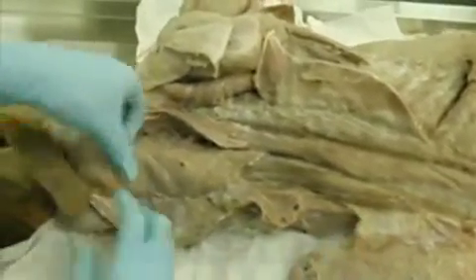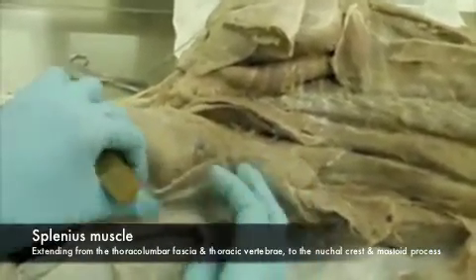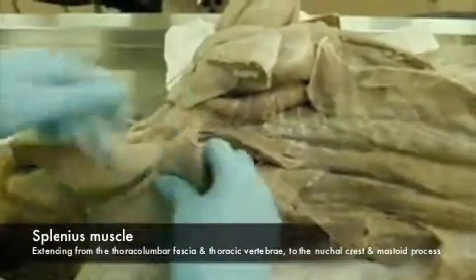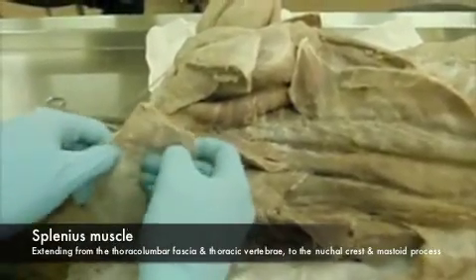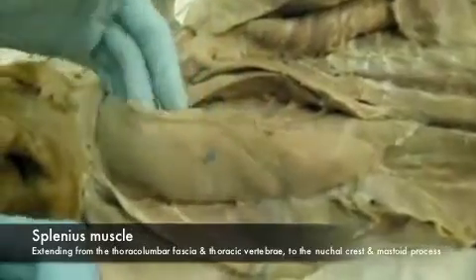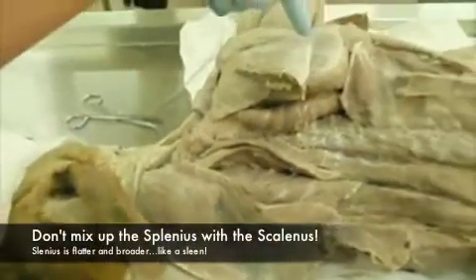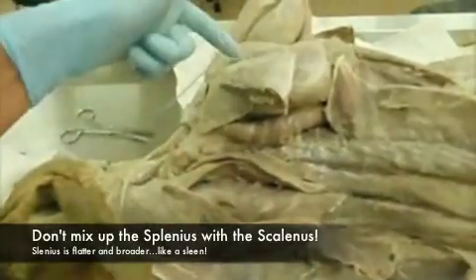First of all, we're going to look at the splenius, which is a flat muscle you can't miss. It's really flat. It lies underneath your rhomboideus. So if you remember, this is the rhomboideus, and then we have a few other muscles on top, like the cervical part of the brachiocephalicus, the cleidocervicalis, that I've removed. I removed the rhomboideus here, popped it, and underneath you have your splenius. So it's kind of flat. The way I remember it is it looks like a spleen because the spleen is kind of flat. Not to mix it up with the scalenus, which is what I just showed you before on the ventral thorax. This is your splenius, that's your scalenus.